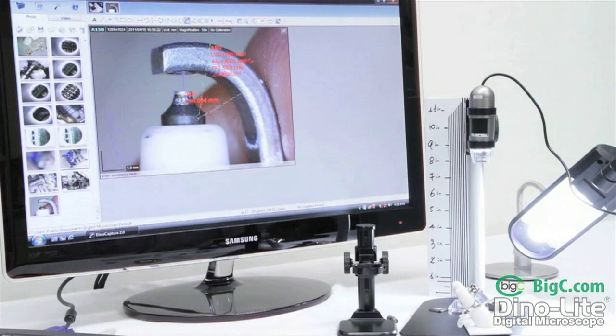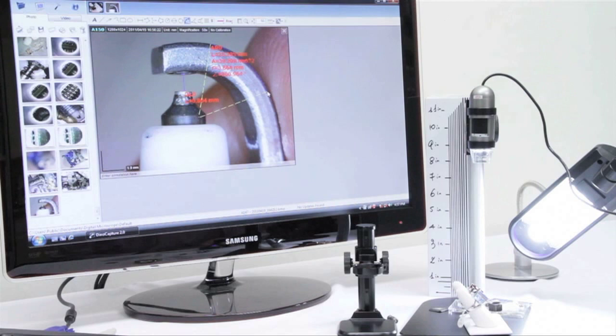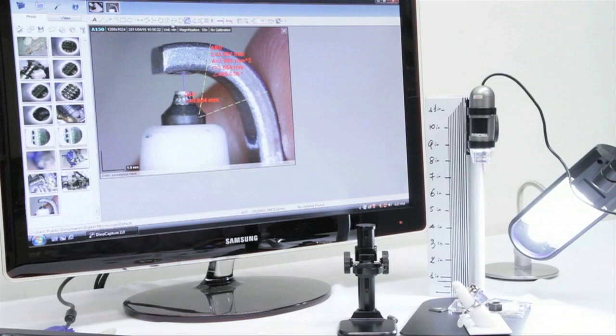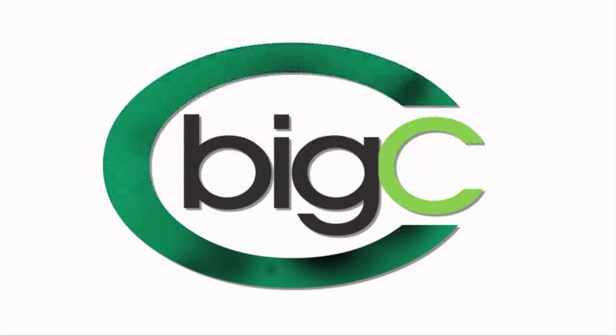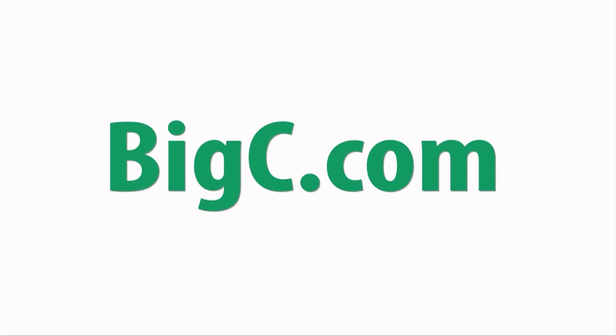We'll click once to select a starting point, click again for an ending point, then click to select the edge of the arc. It will place the measurement and values on the screen. You can save this picture anywhere on your computer.